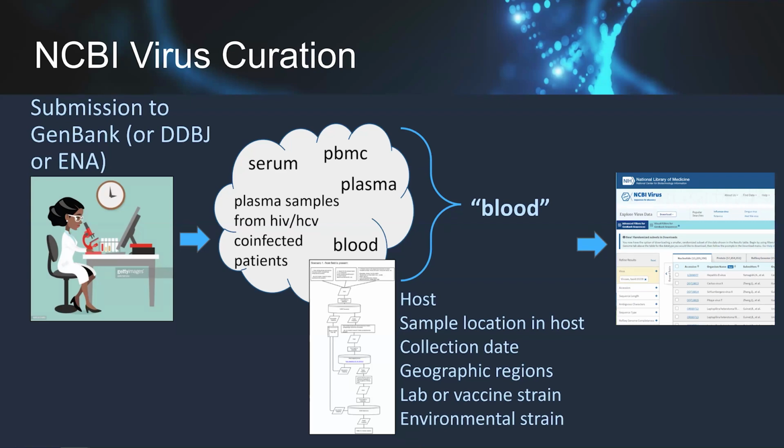And it has very flexible downloads. So if you want the actual sequences, if you want the metadata, if you just need an accession list, it's all very easily, hopefully, right at your fingertips.